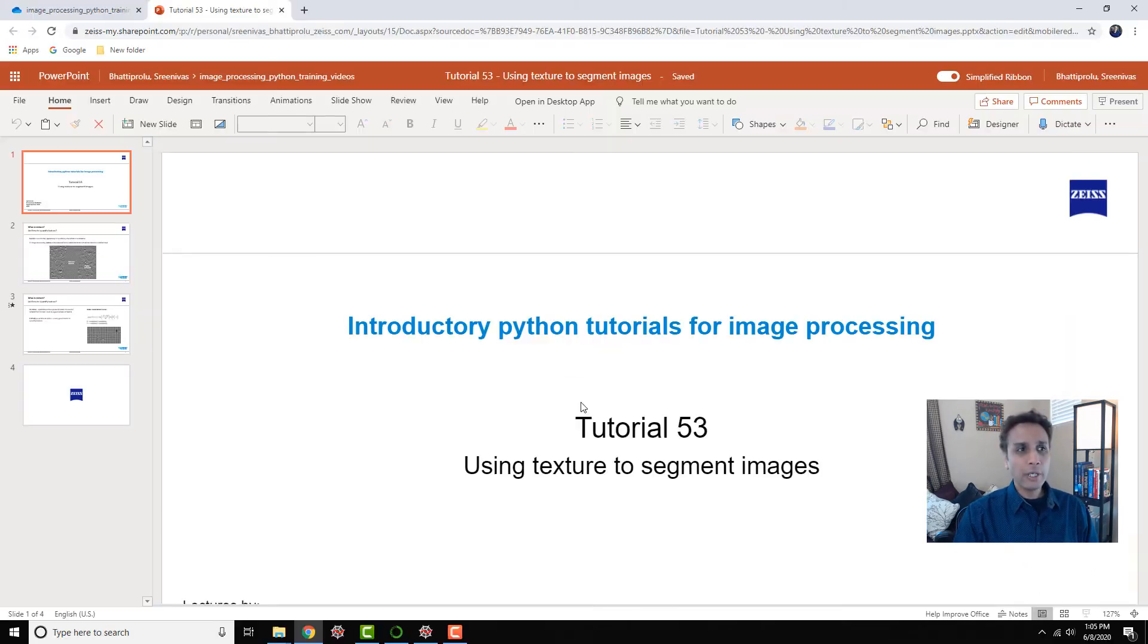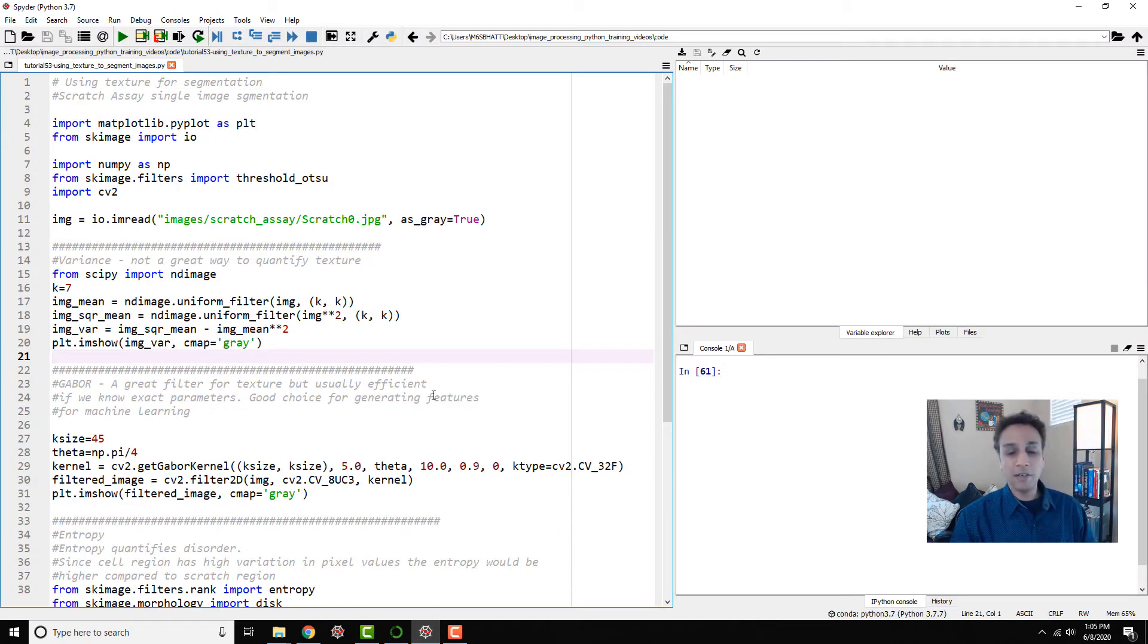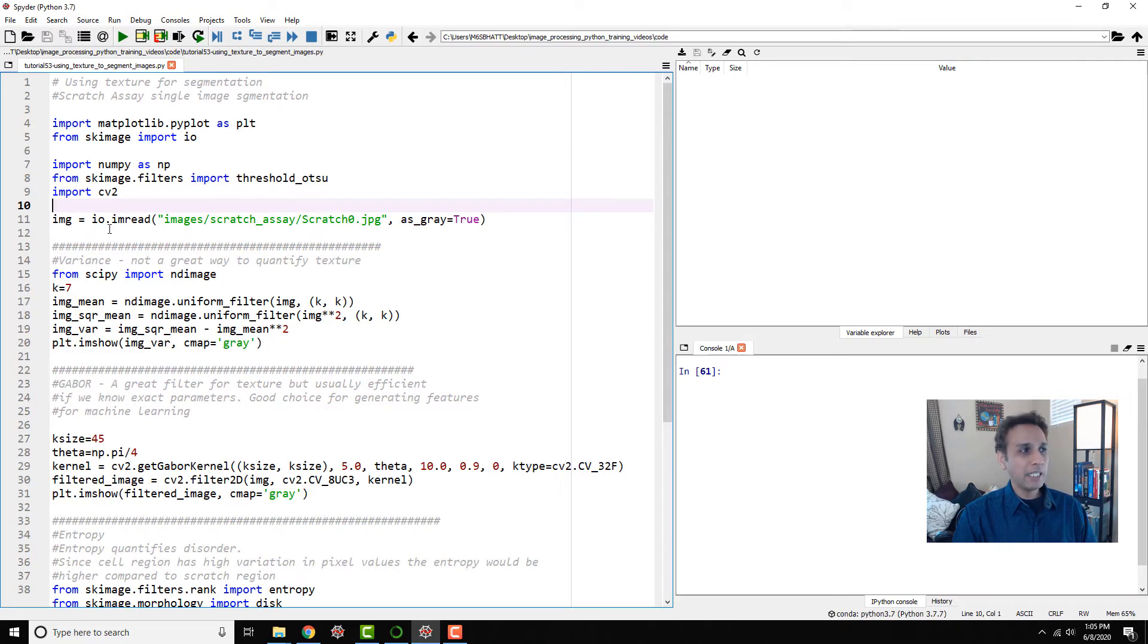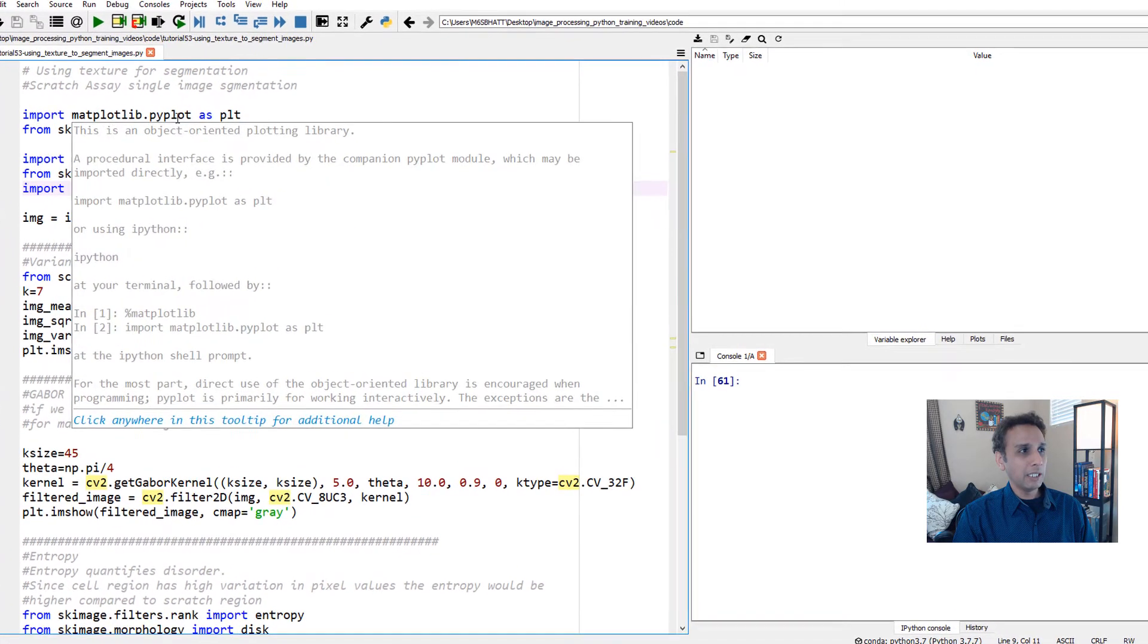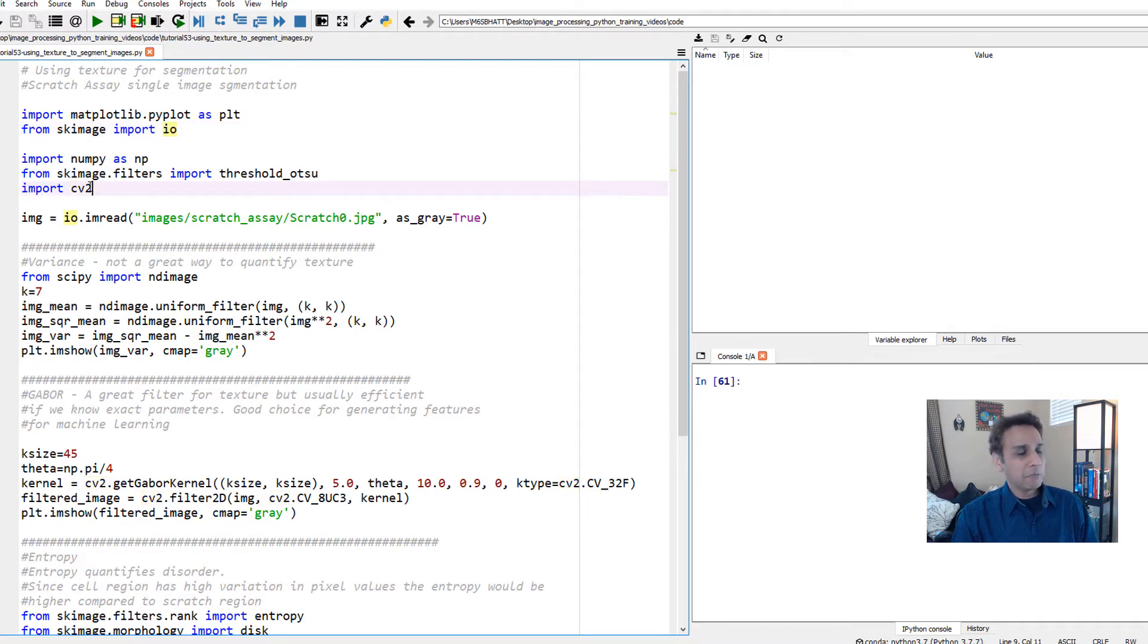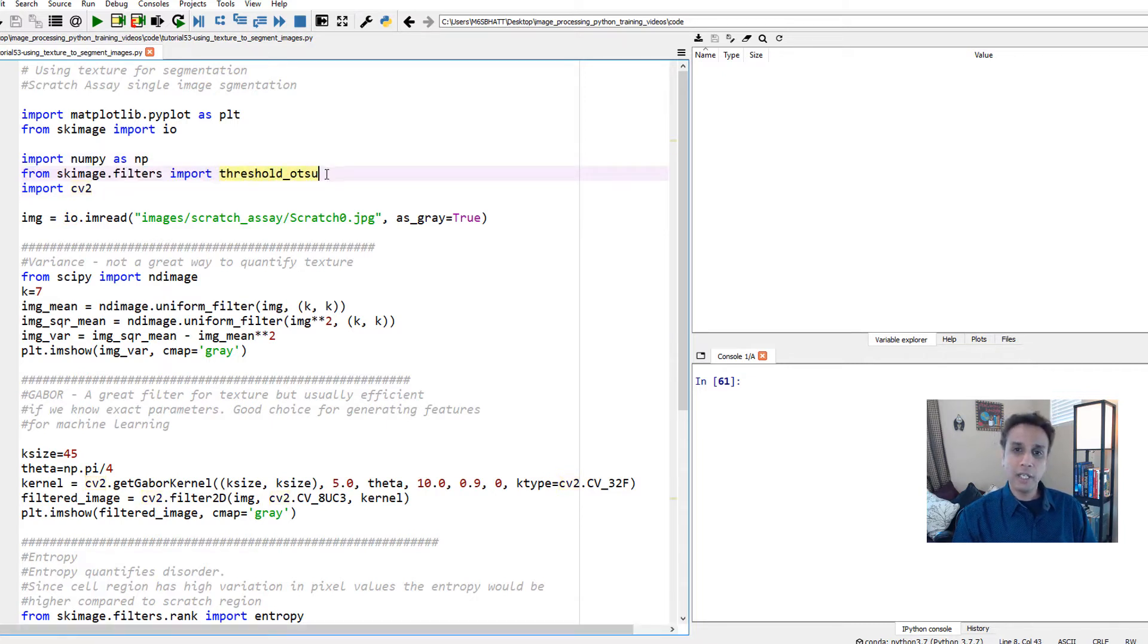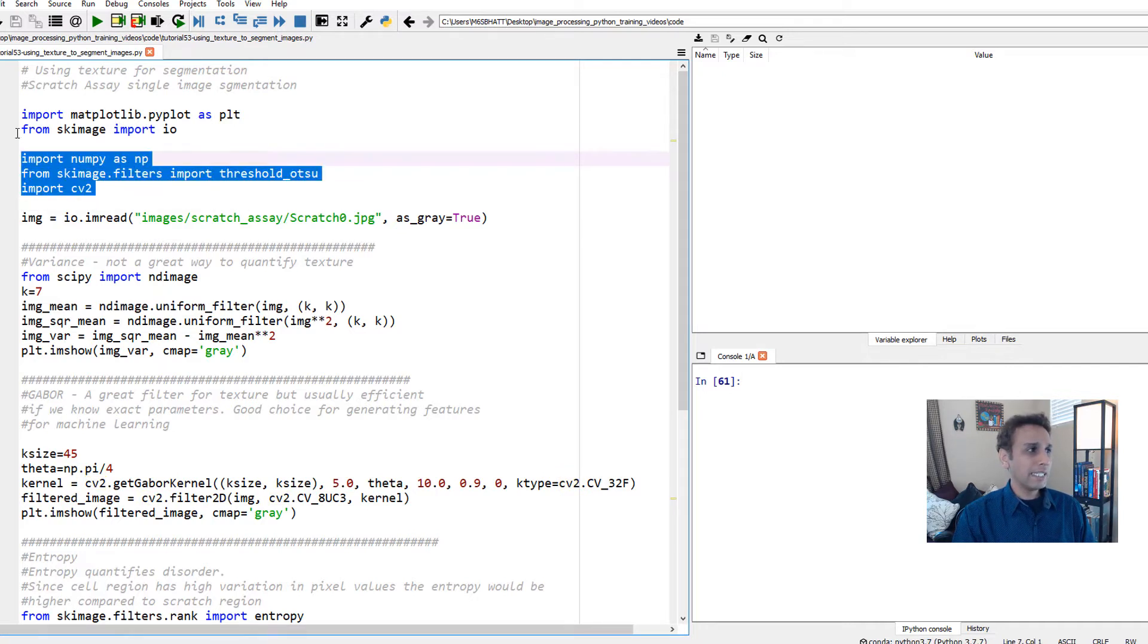That's the quick background. Now let's jump into our Spyder IDE to look at a few lines of code. These lines are the libraries we're going to import. We're importing pyplot for plotting, scikit-image import io for reading images, OpenCV, and I'm also importing threshold OTSU-based thresholding. Let's import these.